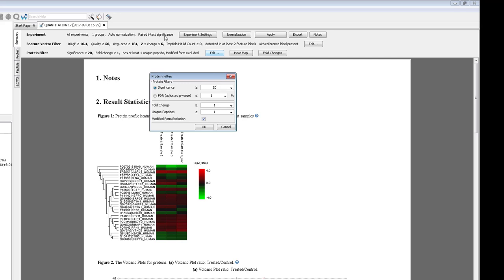If one group is used, such as in this case, a paired t-test is used to calculate significance. If more than one group is used, such as a super-SILAC experiment, ANOVA is used to calculate significance. You can use FDR instead, which is calculated using an adjusted p-value. Modified form exclusion is also included as an option to increase accuracy.